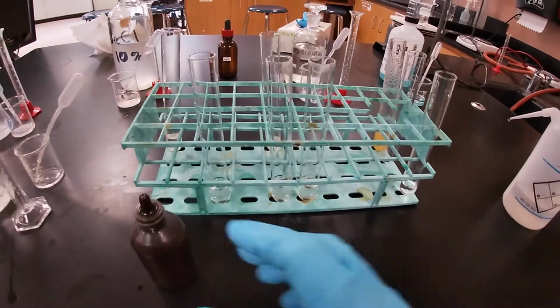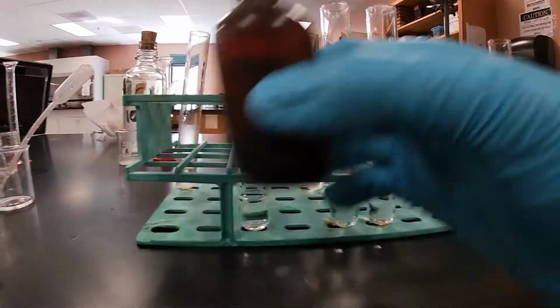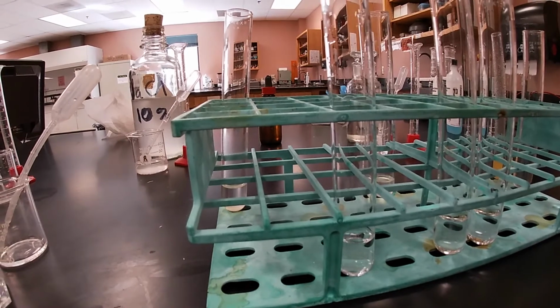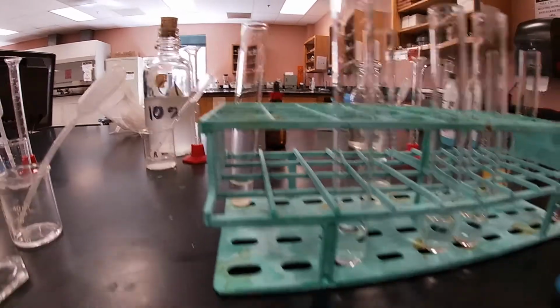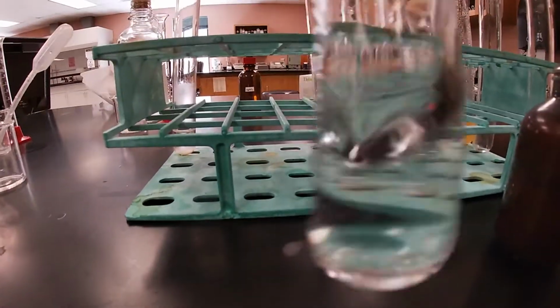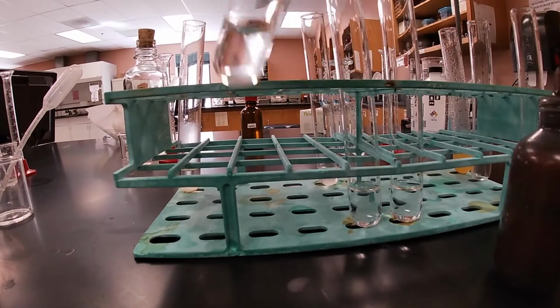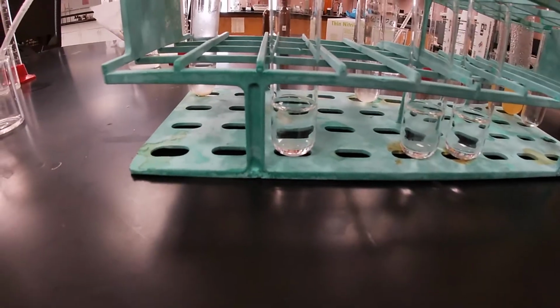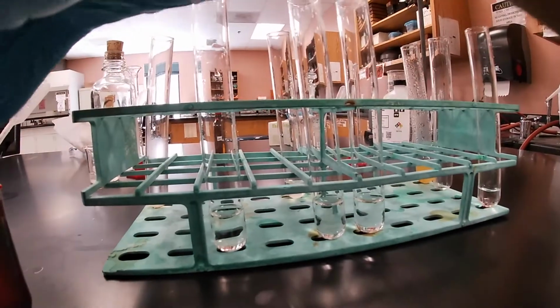So iodine solution. And what we're looking for is for it to turn, remember, blue. And so as we add a couple of drops, not much going on. Nope. And so as we add another one, let's focus in. Nope, nothing really going on. So let's go ahead and close our iodine.